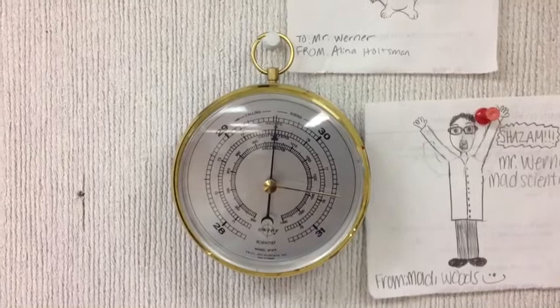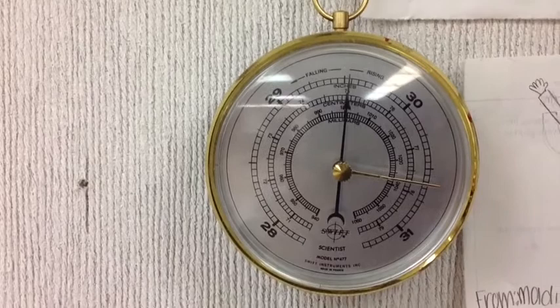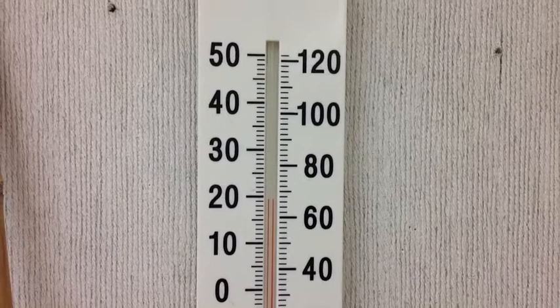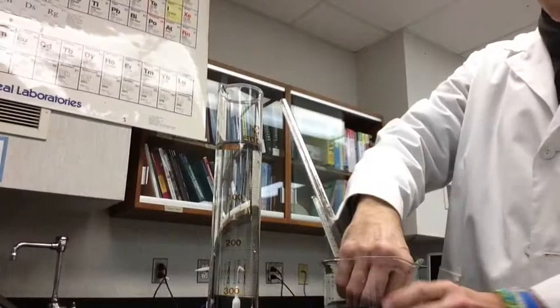You're collecting the hydrogen gas over water, so you need to think about what that means. Look at the barometer to get the atmospheric pressure — it's on the wall behind my desk. You'll notice it's in centimeters of mercury, so you need to convert that to millimeters of mercury. You also need to look at the thermometer to get the temperature in Celsius, and put a thermometer into the beaker to get the temperature of the water, because that's important for finding the vapor pressure of the water.